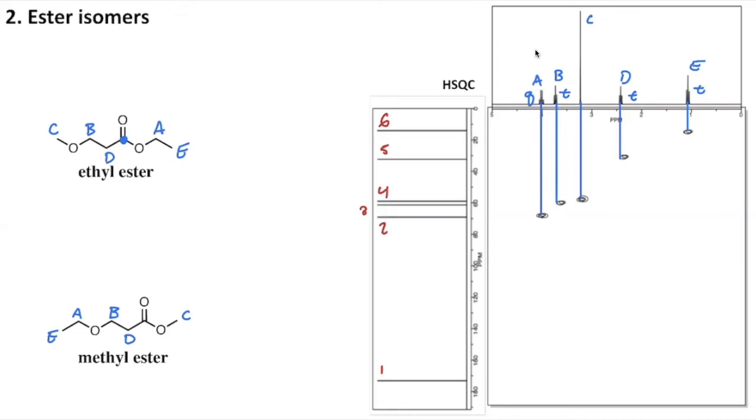Some of them don't line up so perfectly, and that's okay. You just have to do the best that you can, and where there are a couple of peaks close together, you want to be extra careful to make sure you've got it as centered as possible. So using the blue, I've drawn down from the hydrogens, and then to keep a little bit of color coding, I'm going to draw red across to the carbons. Starting from this peak here and drawing over, and waiting for my line to snap. That looks like it goes there. And just following these across.